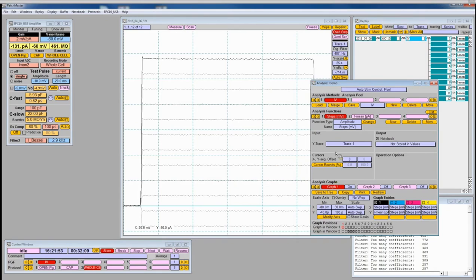And this down here specifies the input and the output. So we are going to record the output in the notebook because it is selected. And we are recording the steps as well as, let's see, the mean. Yes, it's also selected. So we can do that. And then we display this in a graph. And we're going to look at graph window number 1. Okay.